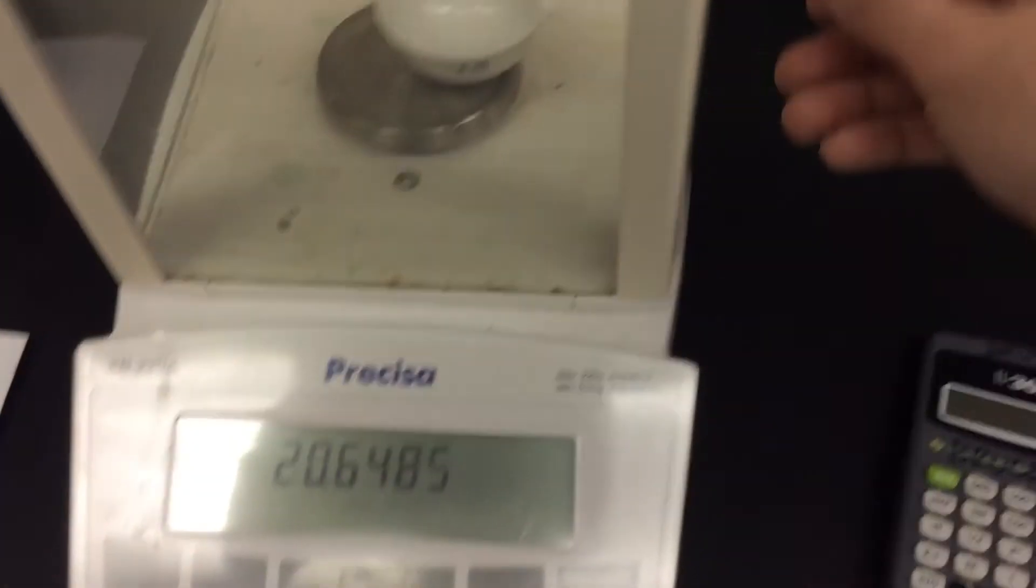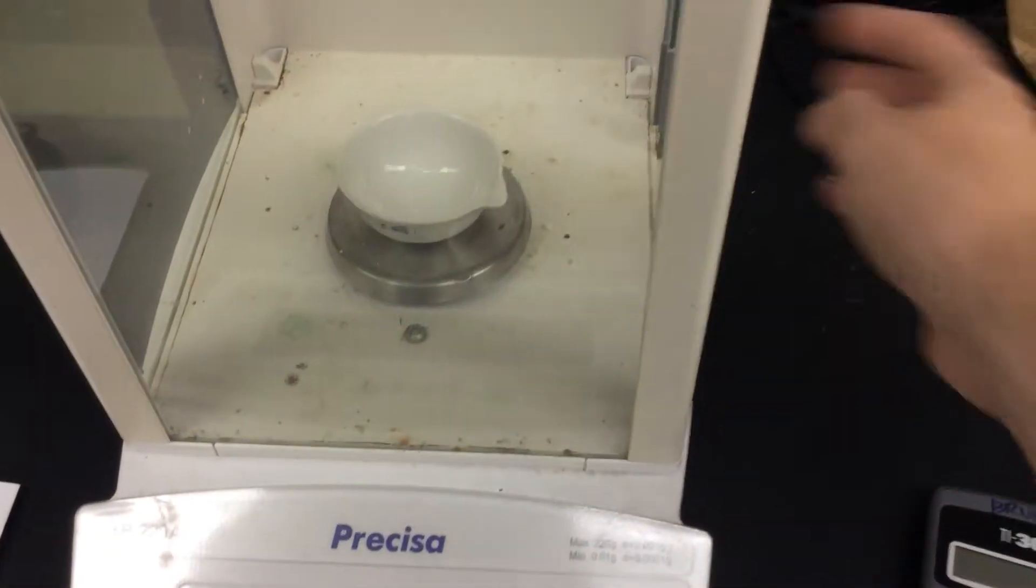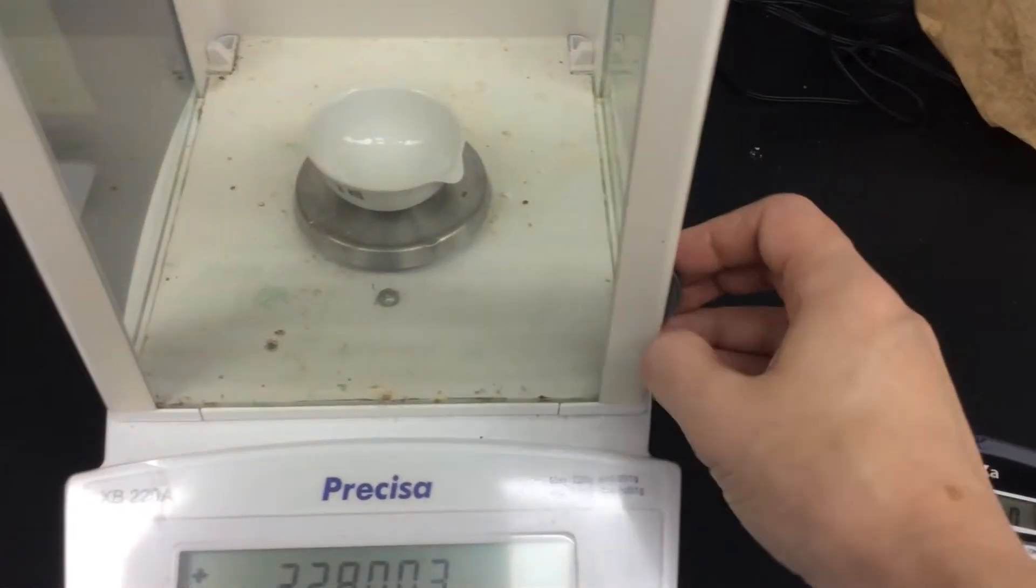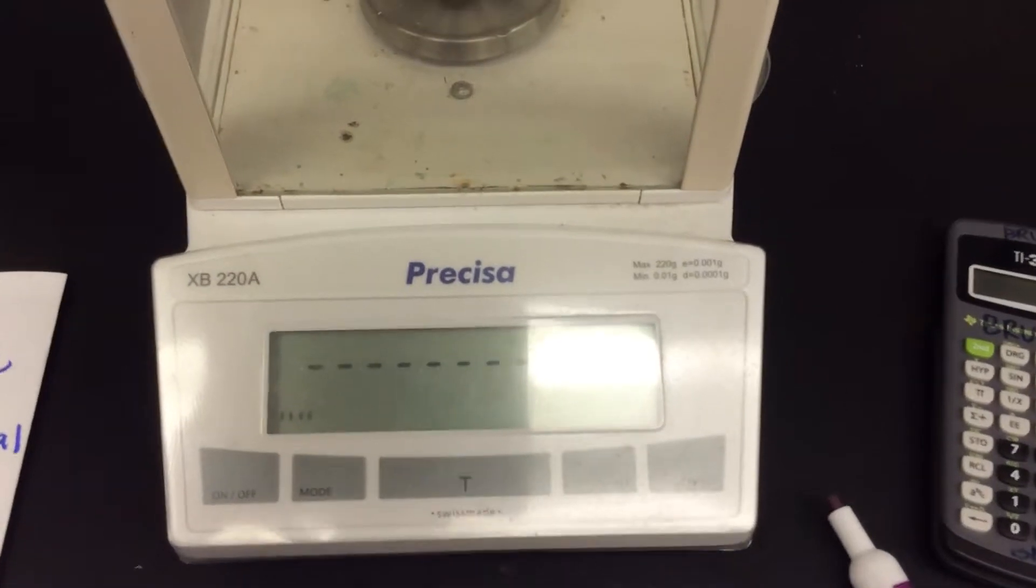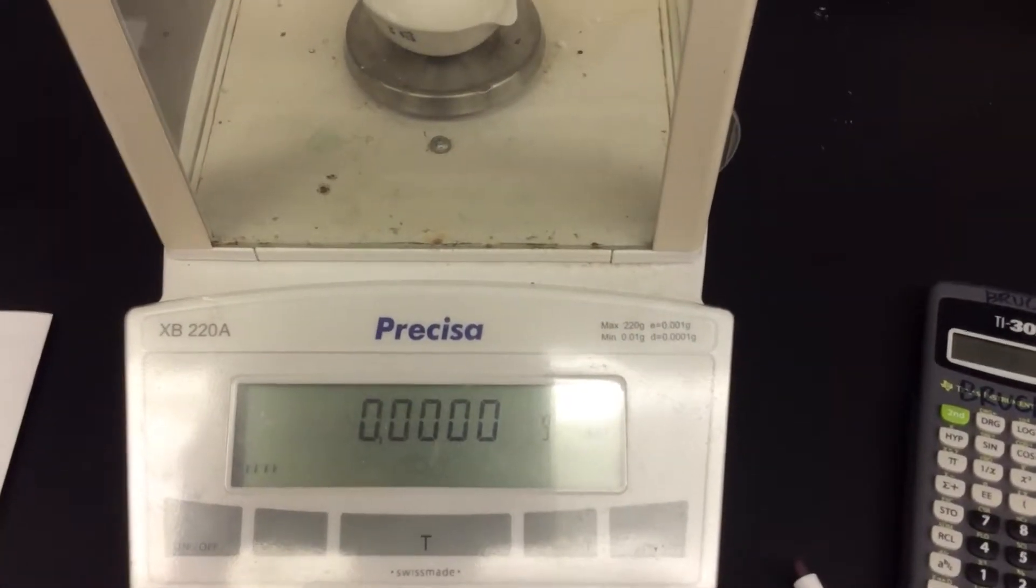So first thing we're going to do is we're going to take our dish, put it on the analytical balance, always close all four sides. And now what we're going to do is tare. That tells the balance, okay, this is what zero looks like.